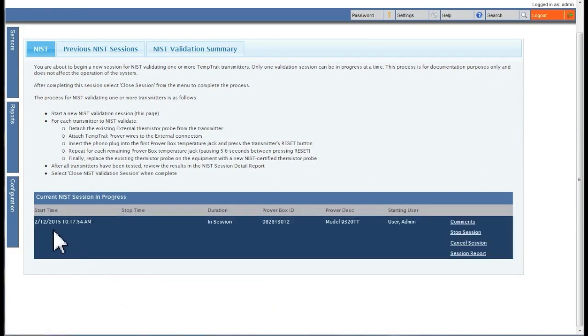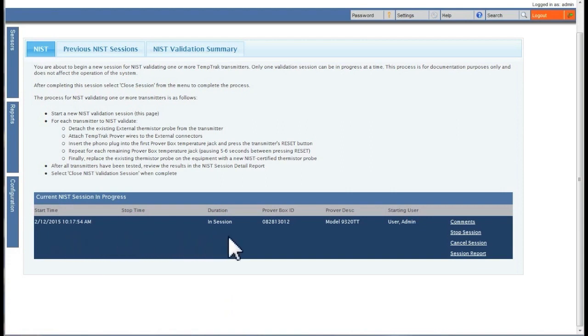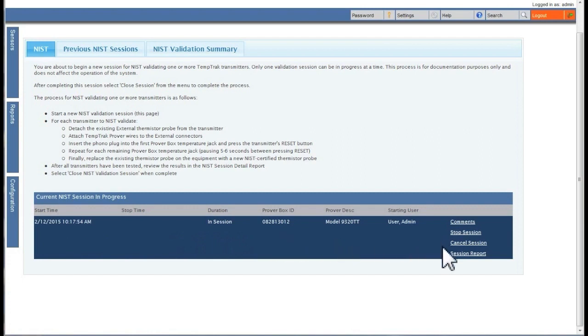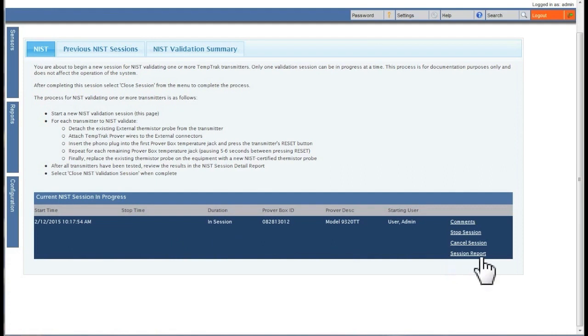Most notably on this page, you will see the start of the outstanding validation session, what Prover box is being used, and who started the session. To the far right are maintenance actions.